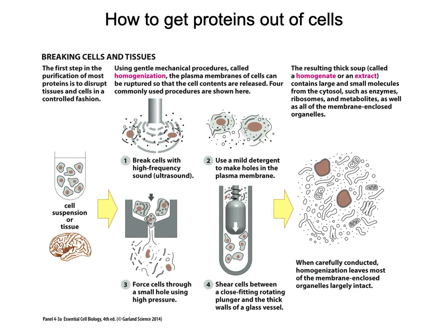The more common method in order to create a homogenate is to use mild detergents. So this is where you might add something like a Tween solution to the cells. Tween is a kind of brand name of detergent. It's going to be able to punch holes in the cell. And this is why washing your hands is helpful, because when you wash your hands, you break holes into any kind of bacteria cells. You also disrupt the lipid layer, the viral envelope that's on viruses. And so what happens to that bacteria or virus on your hands is it breaks that membrane and everything inside breaks out, and so they die. Okay, so wash your hands.